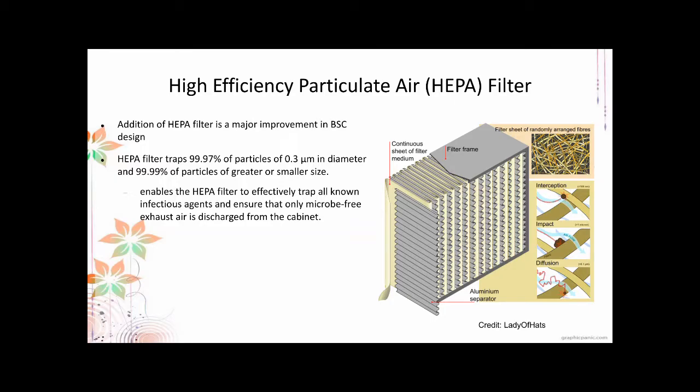So how does the HEPA filter work? It entraps the smaller fragments basically by interception. The filter sheet is made up of randomly arranged fibers. They have varying pore sizes, but there is thickness to them, so that even if some particulates manage to pass through some of the pores, because there are many random threads intersecting inside the filter, the tendency is that you have interception.